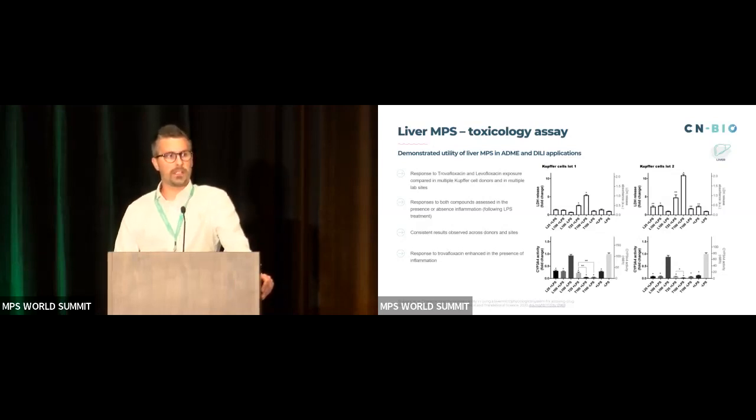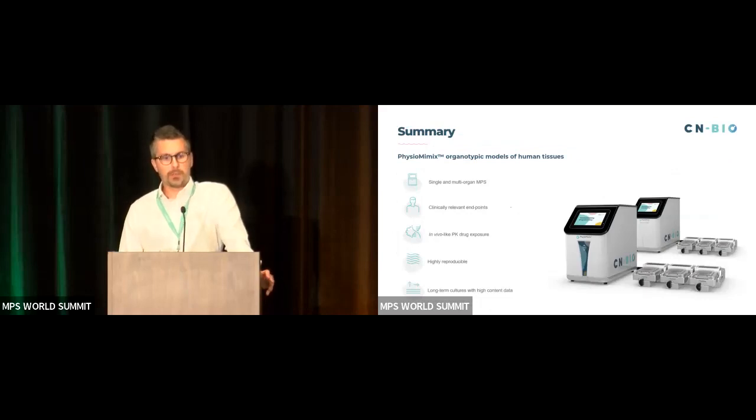So we could do exactly the same study, the same system, and really demonstrate the kind of reproducibility and robustness that you could get this data wherever you are in the world and in whatever lab. So in summary, hopefully I've shown you this afternoon that we've built a liver MPS system that is really robust and ready for use for a wide variety of different uses. The liver microtissues that we form are really, really highly functional and can be used to assess a whole variety of different clinically relevant biomarkers.